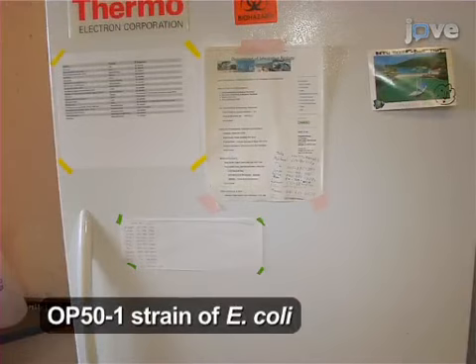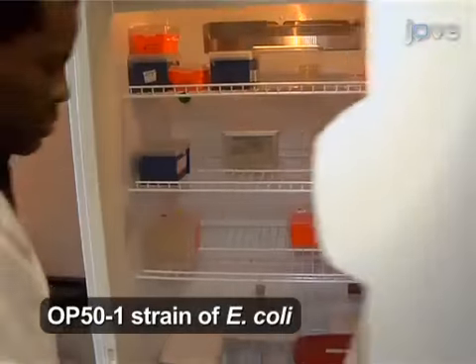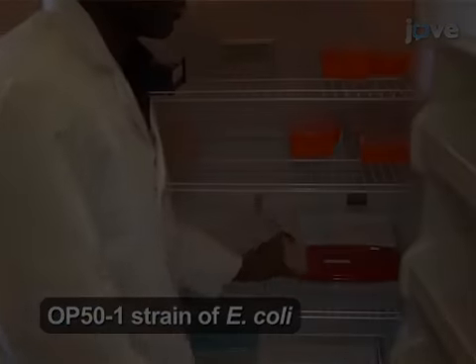To begin, grow worms on several nematode growth medium or NGM plates seeded with E. coli bacteria.